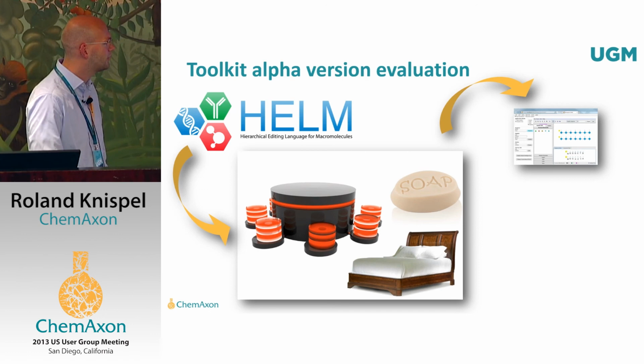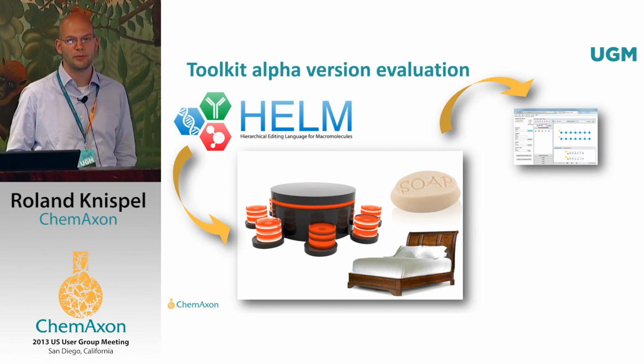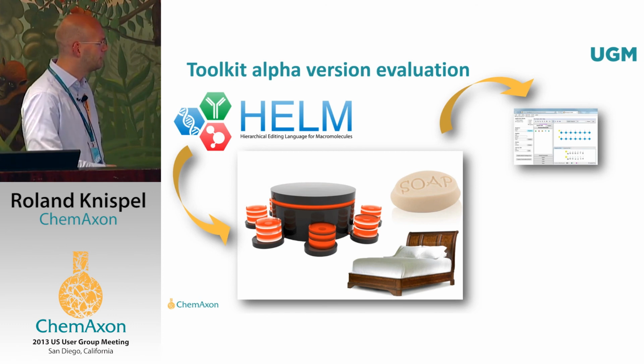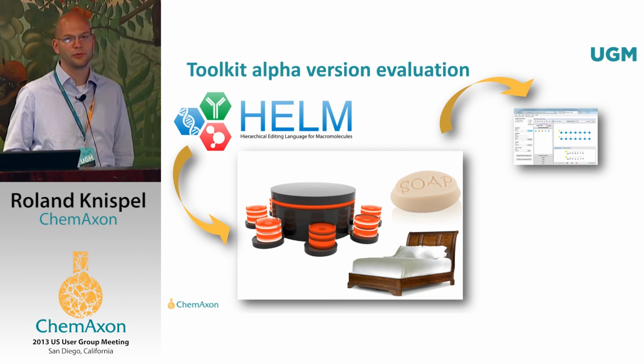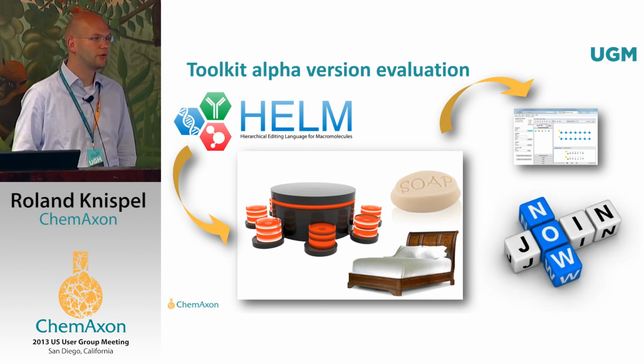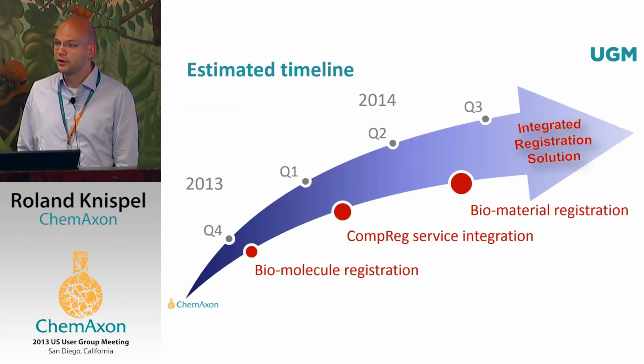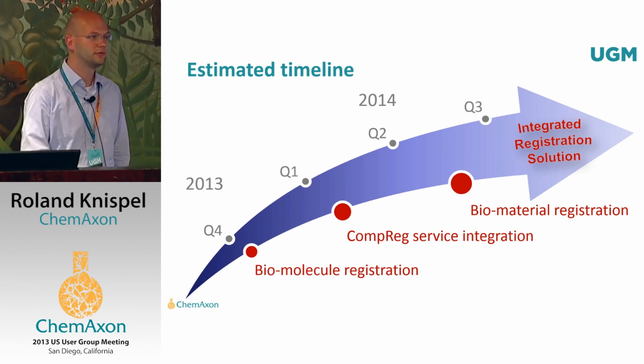And afterwards, these services are brought together in a single demo page where all of the functionalities we've bundled with the toolkit at the moment are exposed in buttons and workflows and things like that. So really, if you're interested, please come and talk with us. I leave this one here. I think we run out of time, but see for yourself.